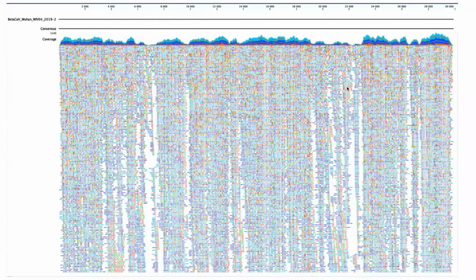So when we look at this, we see here a lot of short sequences. Those sequences are aligned to some kind of a reference genome. And then we have a consensus, which is the agreement, what all the reads mostly agree on in terms of a sequence, and we get a new novel beta coronavirus genome.